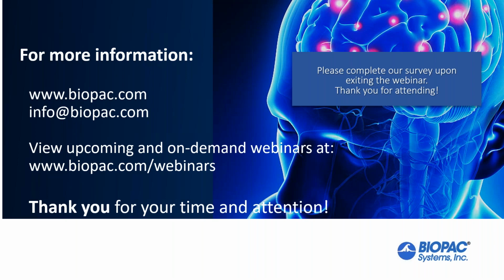Vijay asked a question about how to get the data segment of coughing/yawning, i.e. T1, T2. Let me unmute you. Hang on. Go ahead. I guess I didn't really understand the question, Brenda. Do you mean how to get to that data? Yes, the data segment. Okay, so when I went in, maybe you can switch back over to the other computer, Brenda, sorry. Yep, no problem. There you go. Okay, perfect, thank you.